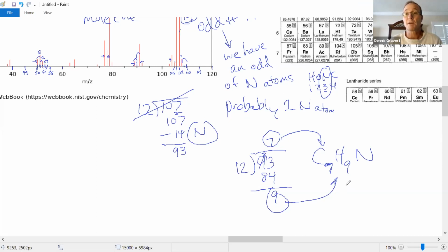Think about other possibilities. Maybe I don't want to subtract the carbon and add in 12 more hydrogens. Probably not. 12 more H's would be 21. That's way too many for 6 carbons. So sorry, I'm talking out loud when this is a video.